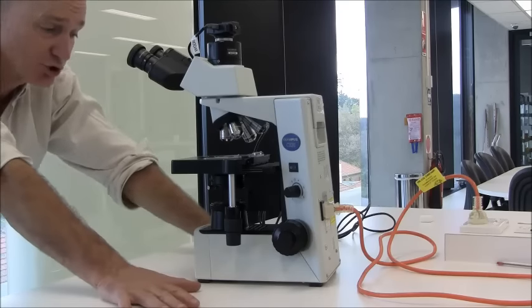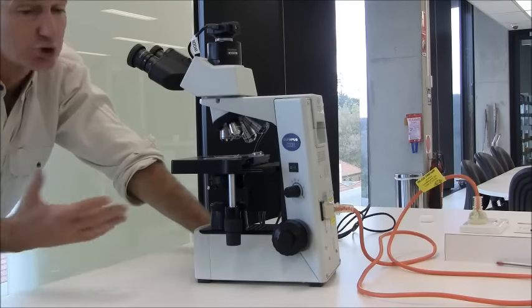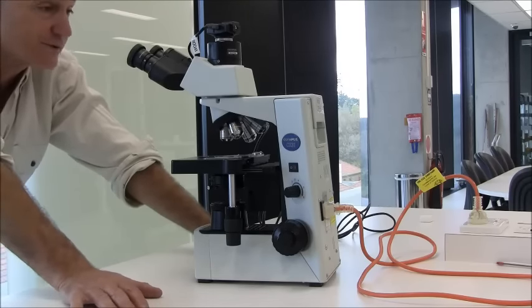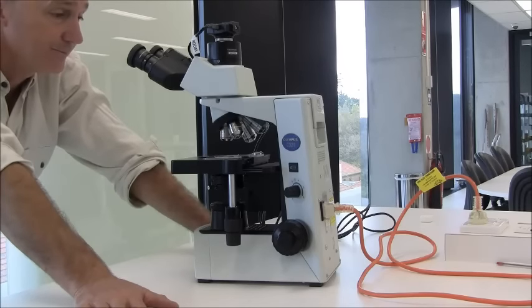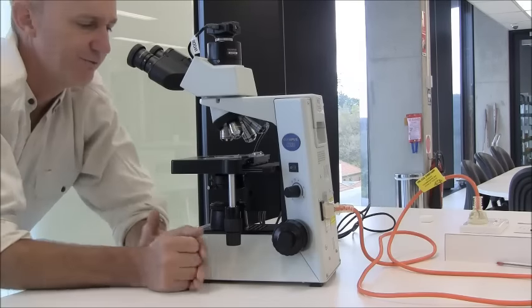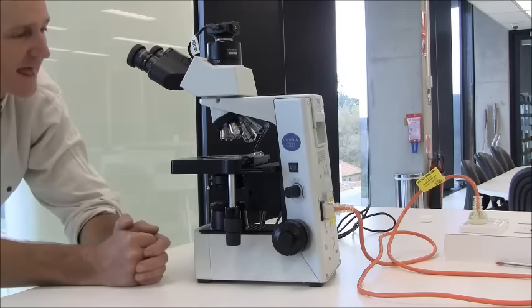This is something that you should do when you set the microscope up, and even every time you swap between, you know, if you're working in pairs, you should really focus for your own eyes. Every time you go to use this microscope, every time you share it with your partner. Some of the images that we're looking at using this microscope are very, very small, and if this isn't focused correctly, you may not see anything at all, or the detail will be very poor.